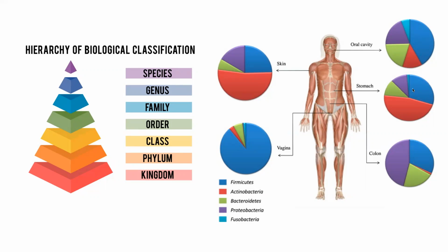However, sometimes you want to look at, for example, the detection of a specific organism. For example, a virus. I want to know whether there is a specific virus and how much of it, and what is the diversity of that specific virus. So if that is my question, then I cannot use 16S sequencing for that, because I am going to be more interested in the full genomes of that virus, and I want to study in detail the differences between those genomes, between the sequences of those genomes.